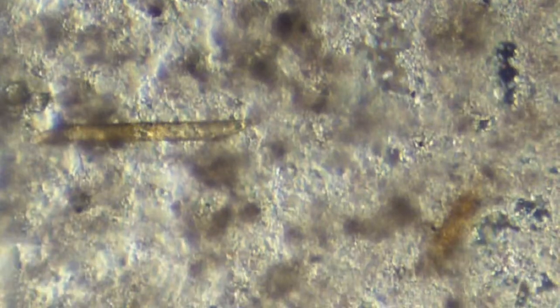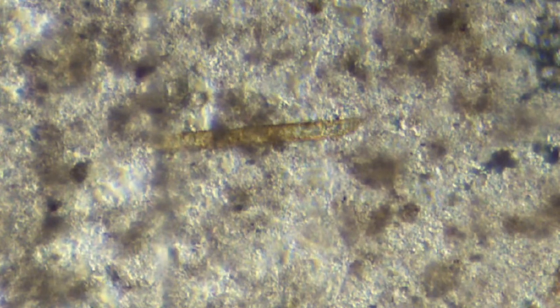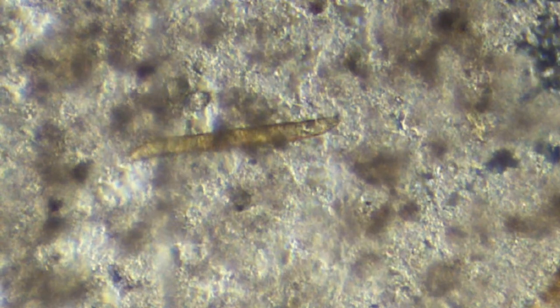Very, very large. This is only, what is this? This is 40 power. So these guys are quite large. Sorry, no, 100 power, my bad. A little obscure because of the debris, but you can see the size difference, and the color is similar compared to this guy. But these are much longer, like a long cigar. Very big.